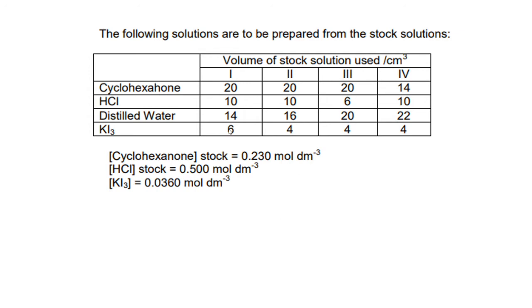And once you're ready, you need to pipette this amount into this mixture, and then quickly you take some sample to actually start measuring the absorbance at an interval of 2 minutes. So that's how you do the experiment. Okay, now you have 4 trials, and these may not be the best values, but these are not values that you should just use blindly.